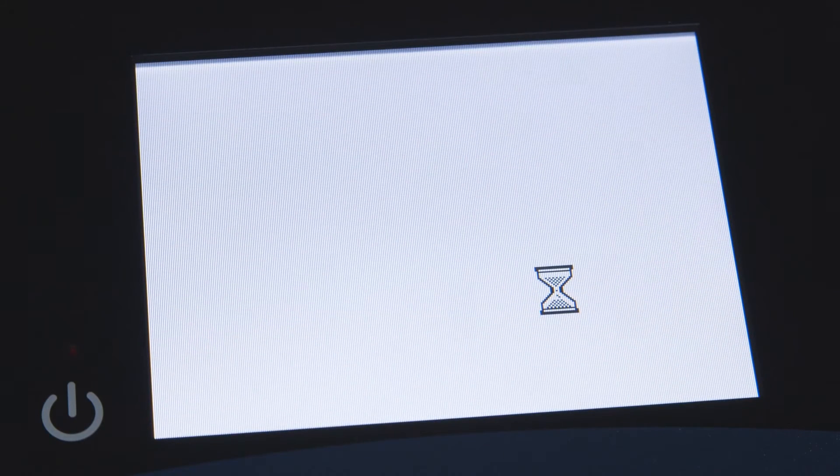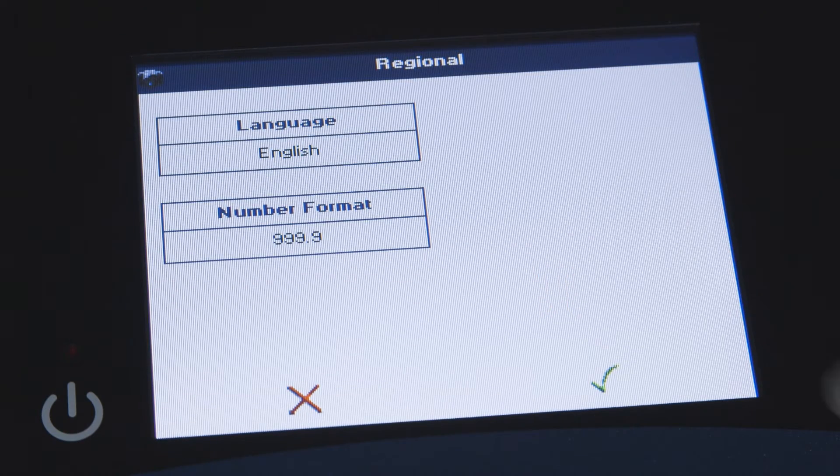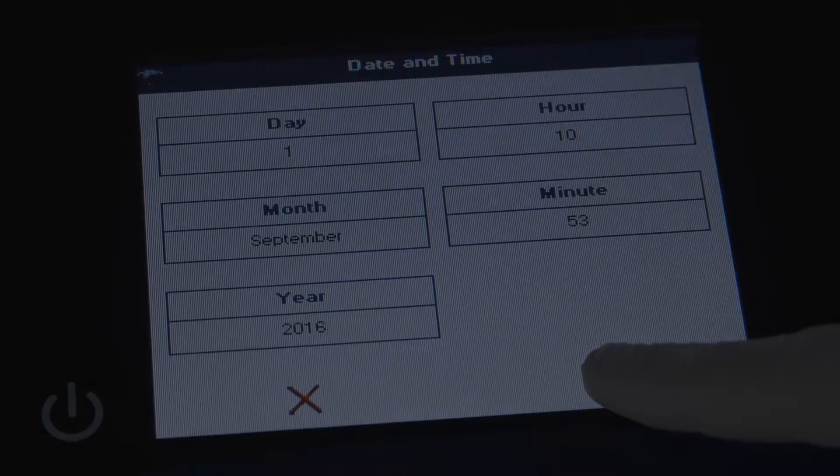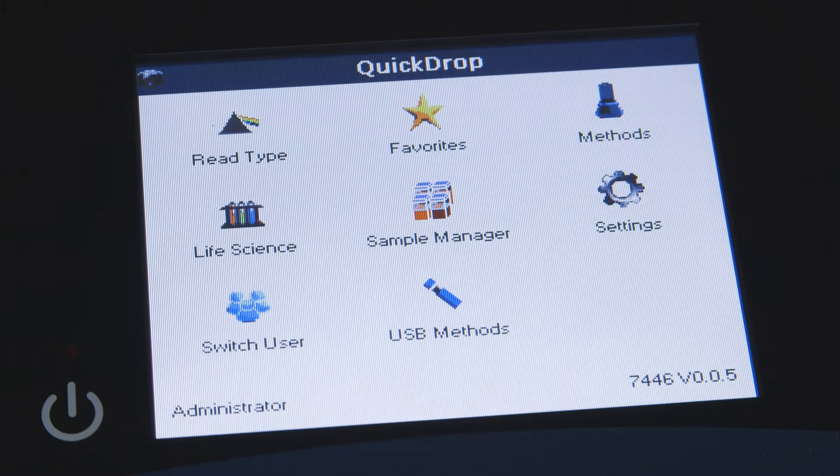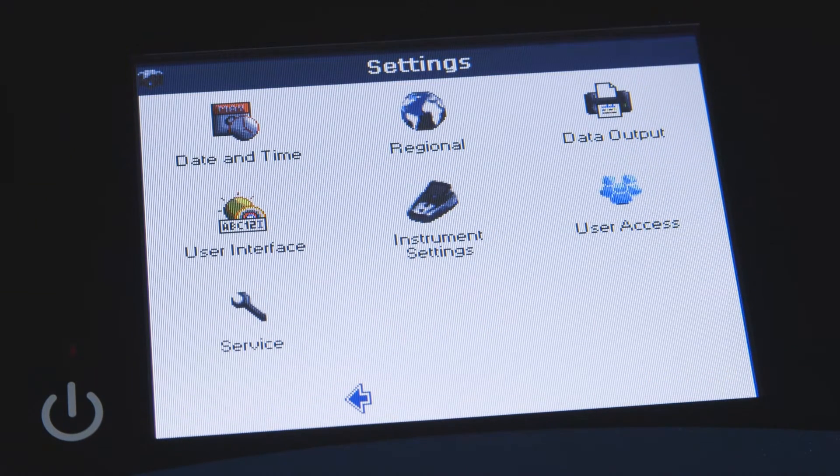The first time the QuickDrop Spectrophotometer is powered on, you're prompted to set your regional settings preferences for language and local date and time. You may also change the setting at any time by touching the settings icon from the main screen.